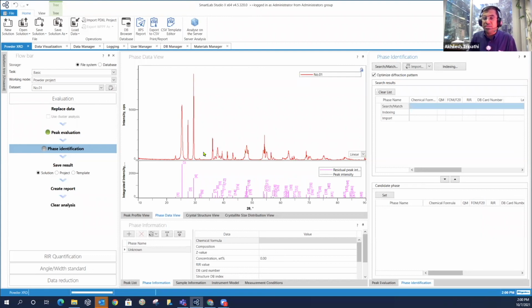We understood planes cause peaks, but if the material has a preferential orientation towards certain planes, then those peaks will be taller. In that case, positions are not affected, but the quantitative amount of that particular phase is affected because its peaks are artificially taller than they should be. Corrections exist in the software to let the software know that I have preferred orientation, and one can correct it.